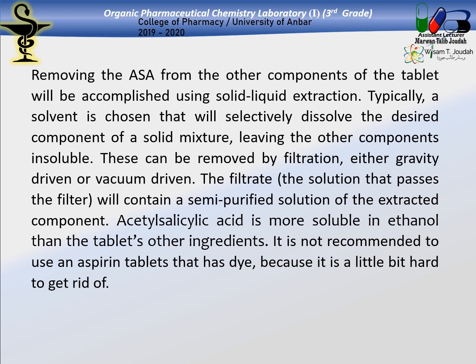Acetyl salicylic acid is more soluble in ethanol than the tablets، لأن شنو عندنا هنا الانجريدينتس. في الانجريدينتس هنا او الاديتيفز او احنا نسميها الفيلينجز او البايندرز هي اللي راح تخليها غير soluble. فالمفروض انه انتم من تستخدمون جمل بيور اسبرين يكون ذاب بالايثانول، لكن التابلتس يكون يعني slightly soluble.